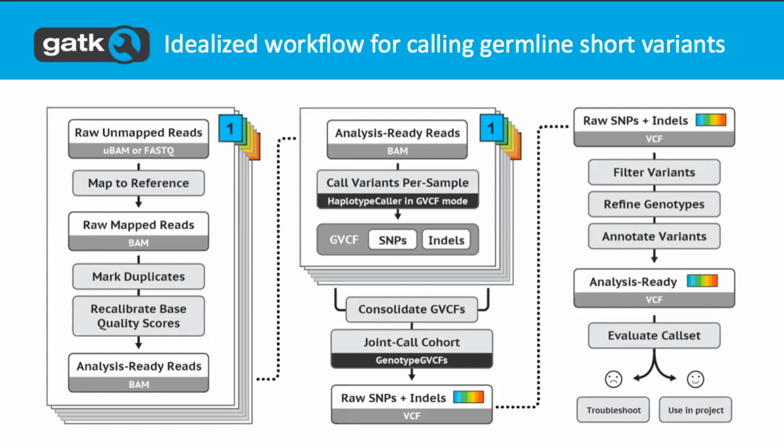It's interesting because that one was written by two people who used to be GATK developers, Mark DePristo and Ryan Poplin, who were part of the original GATK team, gone off to Google. It's a hybrid approach that works in two steps, where the first step is basically HaplotypeCaller, which makes sense because those were the guys who wrote HaplotypeCaller in the first place. And then the second step is a deep learning based classification of the variants.